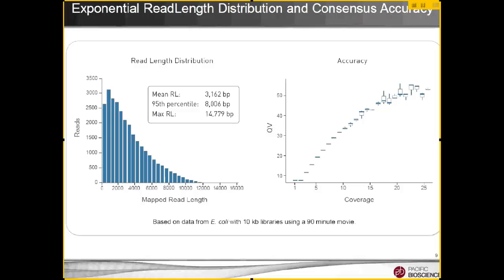Because with PacBio you're not just getting a bunch of bulk reads to do the standard sort of sequencing stuff. Like I said, partly because it's lower accuracy, but also because for a lot of the applications, you really just care about how long your read is. So this is showing you, and this is actually one of their older chemistries, they've been managing to get this curve to shift a little bit over here.